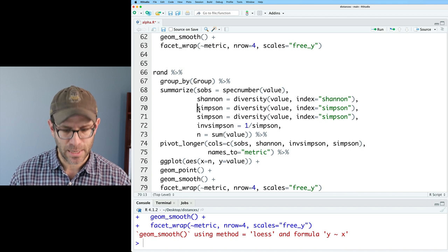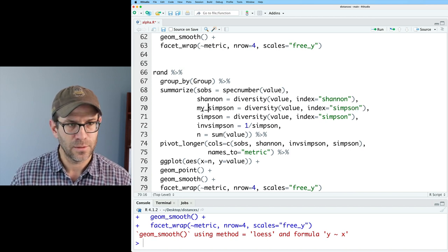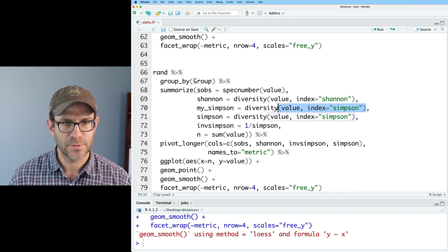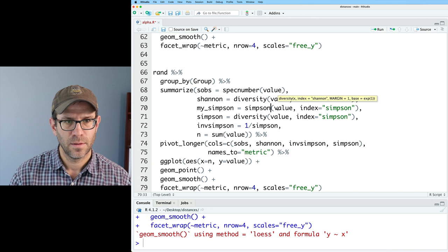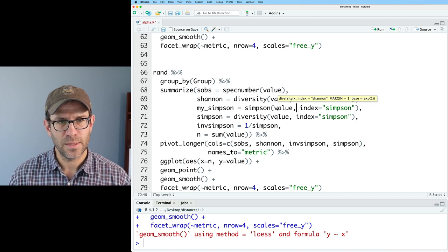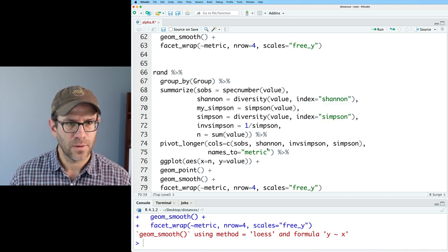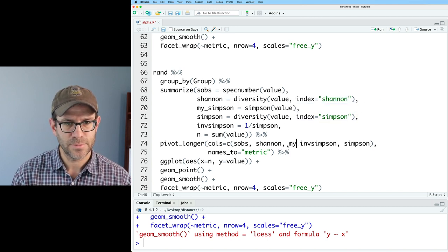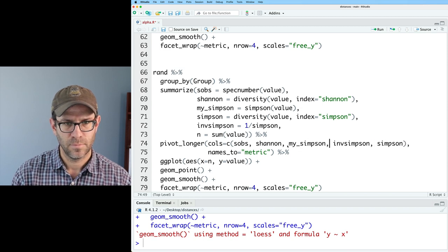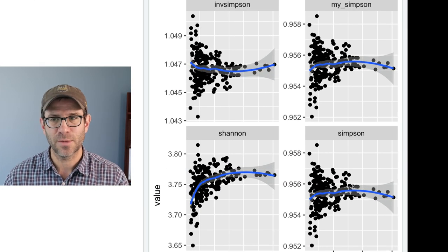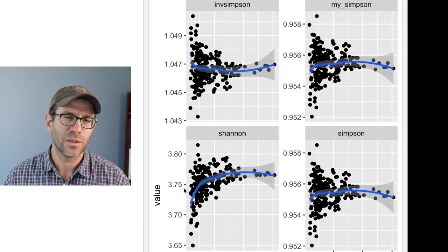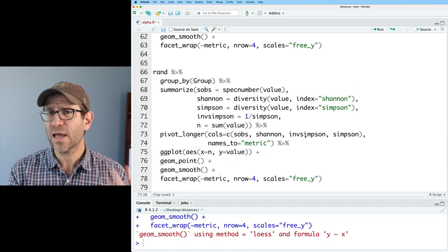I could say like my Simpson equals Simpson on this and remove the index stuff. And then I'm going to want my Simpson. So now I see that my version, sure enough, recapitulates what they are using in vegan.